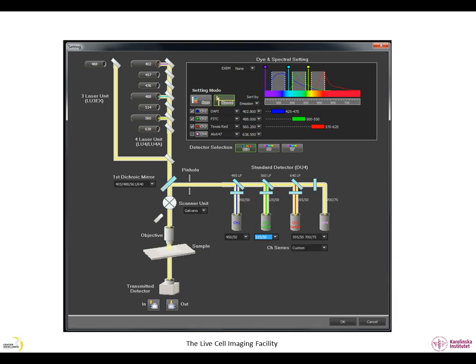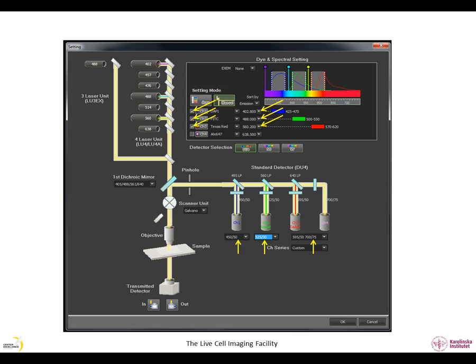Each detector has a laser associated to it. You can select or deselect a laser detector pair using these boxes. The laser associated with each detector can be changed here. Finally here, you can select the appropriate filter cube containing the secondary dichroic mirror emission filters. If you are unsure which laser or filter to use, please watch the LCI video called Bleedthrough.